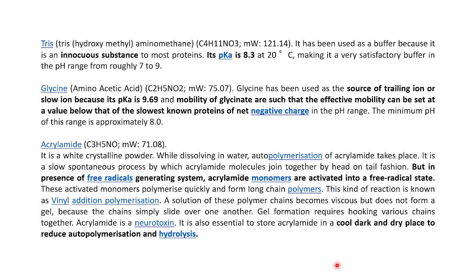Okay, so in a stacking gel we use a Tris with a pH of 6.8, and in a resolving gel we use a pH of 8.8. So here the glycine would have two different charges, right? In the stacking gel there are three ions playing a role, and in the resolving gel also there are three ions present.